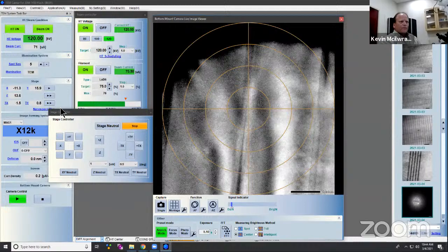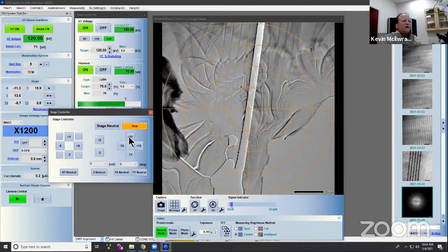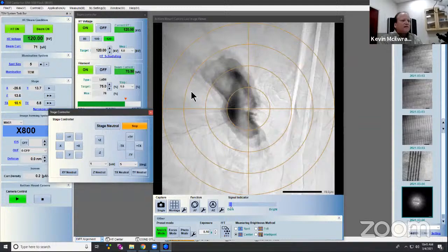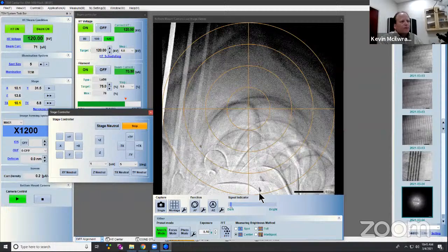And like I said, if we tilt around to higher angles, you'll see, oops, you see a lot going on with the crystalline structure. Actually, these bend contours are causing it to change. And you see a lot of diffraction contrast in Z contrast. We probably wouldn't see this as heavily. And I've got a piece of dirt that somehow landed on this, and I'll have no way of getting it off because it's huge. But then again, we go back through this line and it goes to the edge of the sample. Come back to the center. So it's a great sample just because it shows a lot of different stuff.